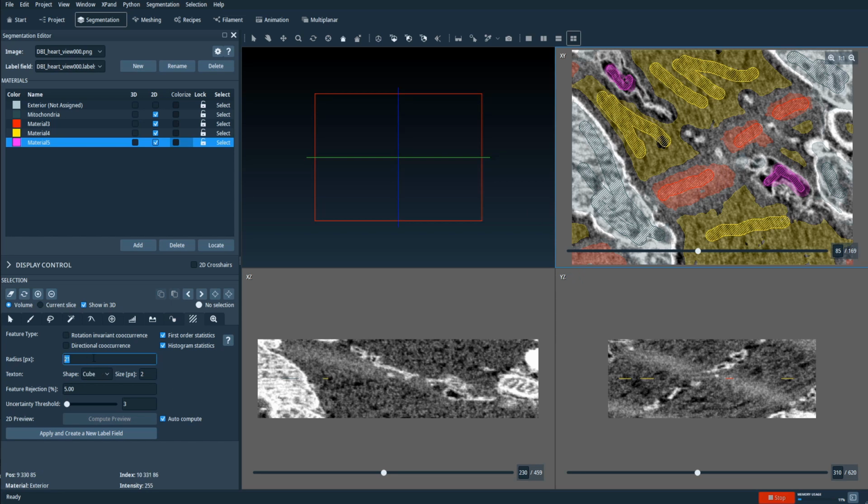So this is one of the things that I would usually adjust first. And now this looks quite okay for me. And keep in mind that you don't have to classify the whole image, because later on we can apply post-processing, such as a Watershed, to complete the whole segmentation.